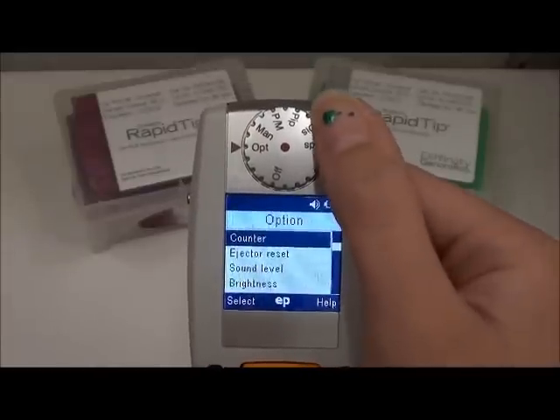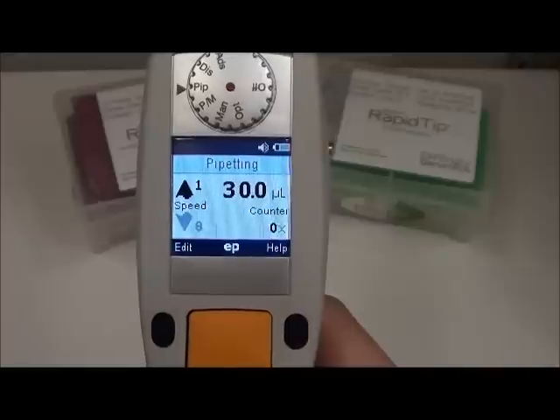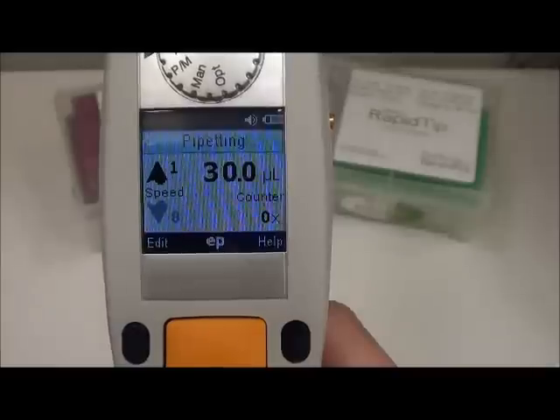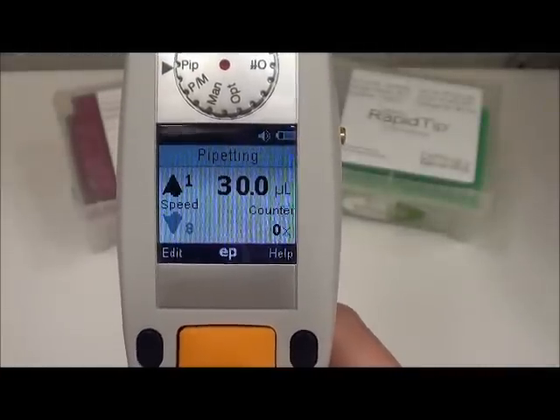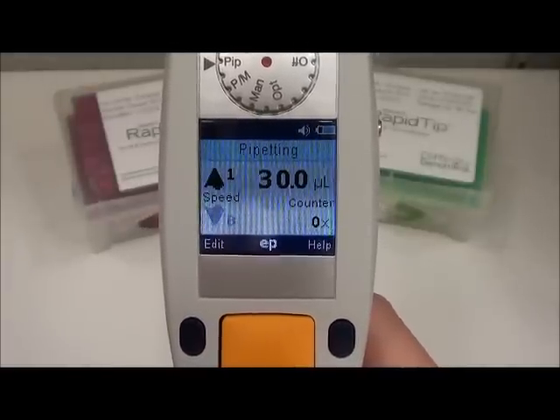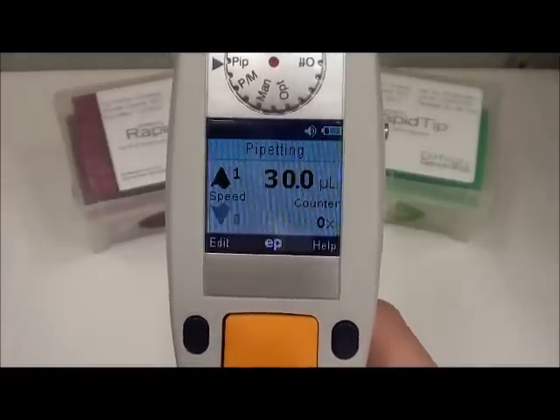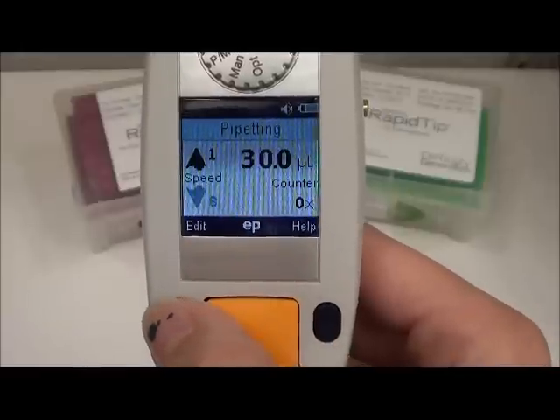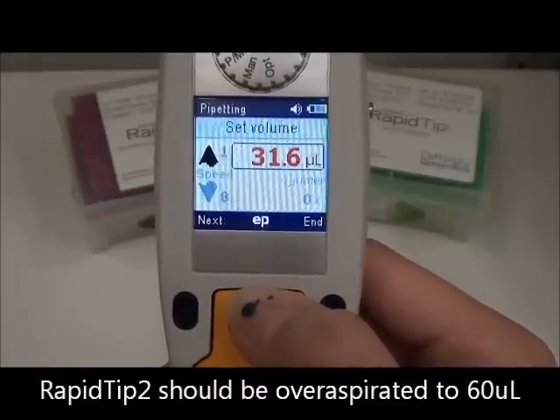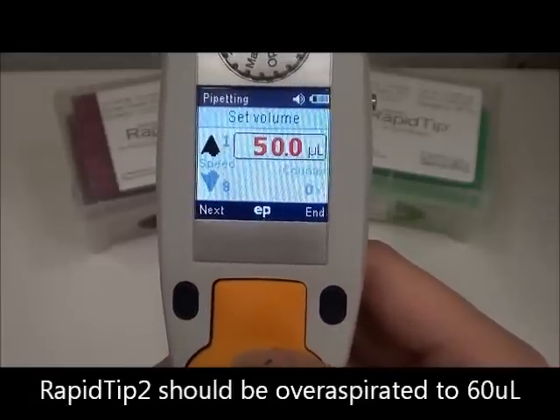We're going to change this over to pipette mode first. It says pipetting on the top, and right now it's set to 30 microliters with an aspirate speed of 1 and a dispensing speed of 8, with the counter at zero. For Rapid Tip, it's going to be a 25 microliter sample volume, over-aspirated up to 50 microliters on the pipette settings. So we're going to go to edit over here on the left — it highlights the volume — and we want to put that up to 50 microliters.